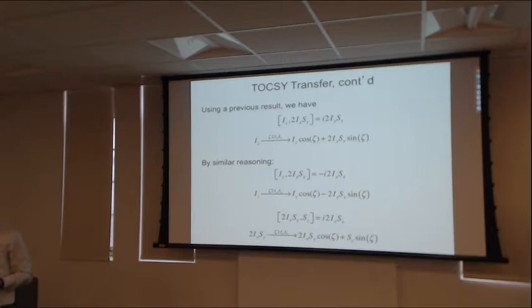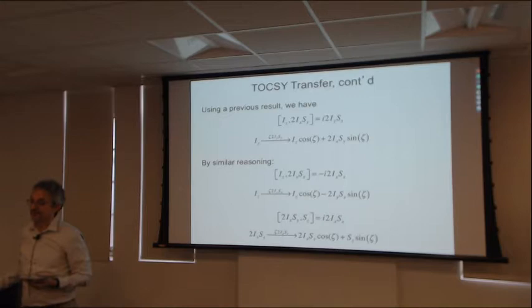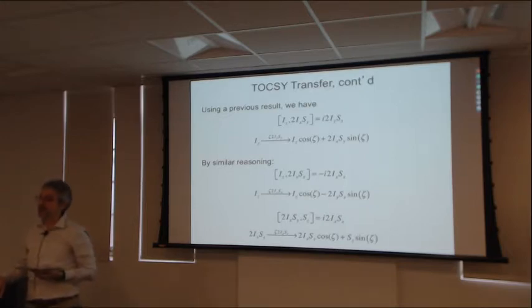So how do we eliminate chemical shift? Right, we do spin echoes. And in this case, the delay in the spin echo would have to be short enough that there's no substantial chemical shift evolution during the delays.